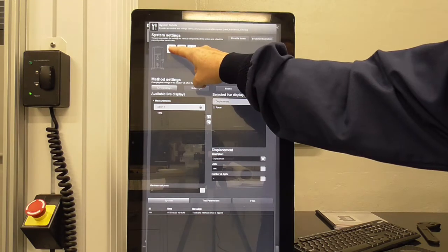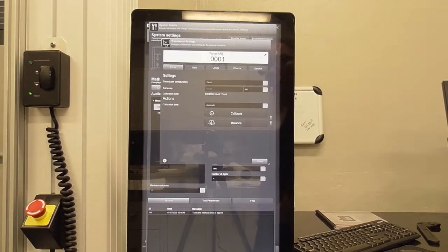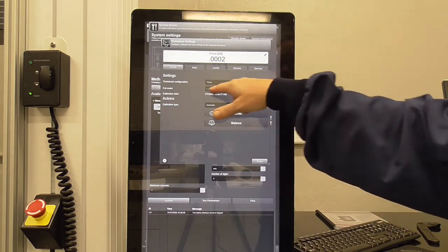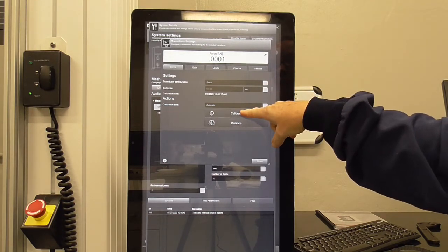These are the different calibrations you can do: strain gauge, load cell, and displacement. We're going to calibrate the load cell. This page pops up and we make sure it's reading 100,000 Newtons — confirming we have the right load cell plugged in — then hit calibrate.